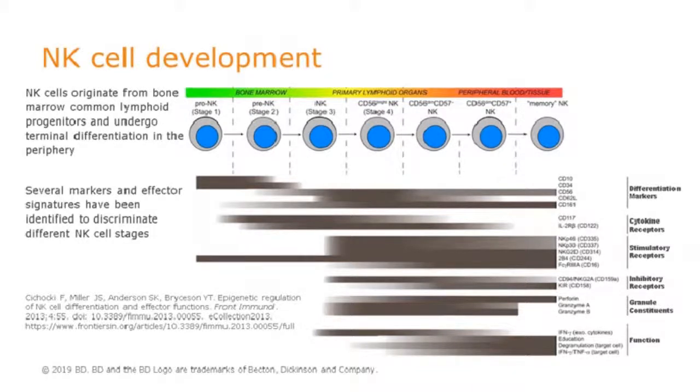The fate and maturation state of NK cells can be mapped by assessing the expression of different receptors that define these subsets. It's important that in flow cytometry we use surface markers primarily as a tag that allows us to call a cell based on its phenotype, but biologically all these markers exert a very specific function that is necessary for the role that NK cells play in immunology.